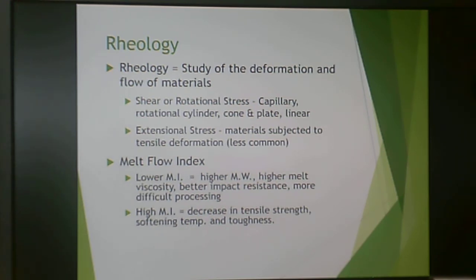Rheology is another important thing. It's often for thermosets, but it is something that comes into play in thermoplastics when you have materials in the melt. Rheology is the study of deformation and flow of materials. I teach an entire graduate course on this, and there's a wide variety of ways you can measure rheology. The one that is of most concern when you're looking at thermoplastics is melt flow index. And you'll see this reported as part of the parameters of any material.